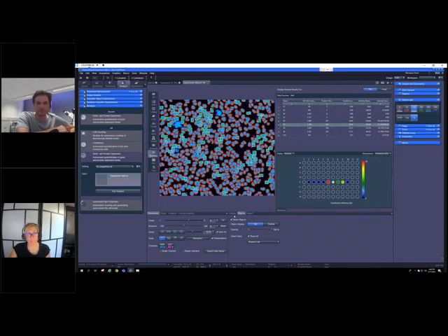And are there plans to add any more bio apps in the future? Yeah, of course. This would be very nice, and this is very much depending on the market requirements, I would say. So please test the bio apps, use the bio apps, give us feedback on what is needed and how to continue. But as you see, the framework is there, and implementation of more bio apps would be more than welcome from our side.